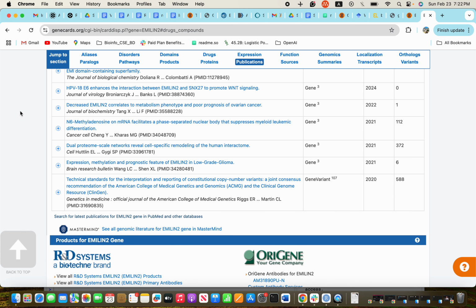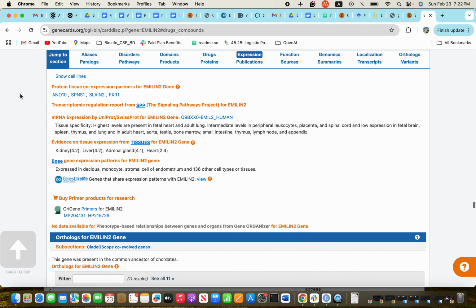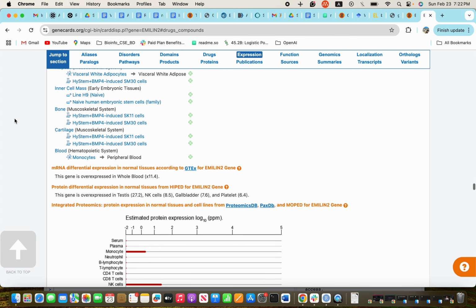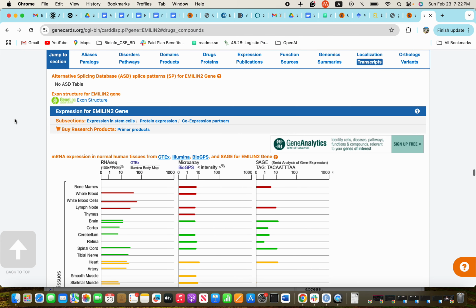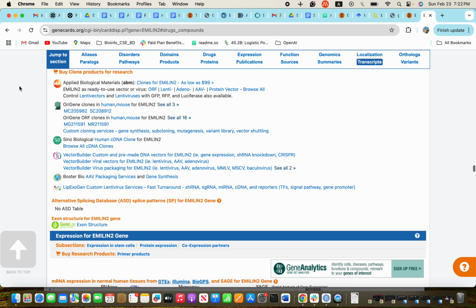We can manually search all of the up and down regulated genes here and find their related information. In this way, we can plot a volcano plot to see the differentially expressed genes and their related functions, drugs and other information.